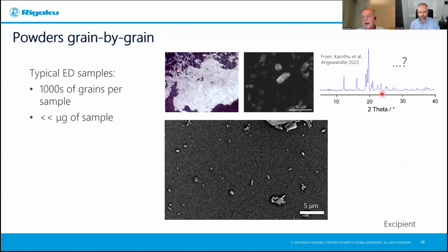Just by looking at the data. But surprisingly, when I took that data through a search match, I couldn't find what the API was. I couldn't find it at all.